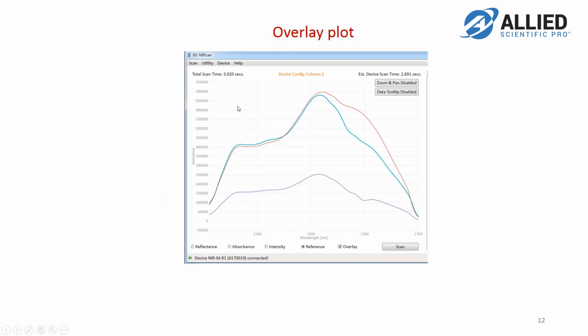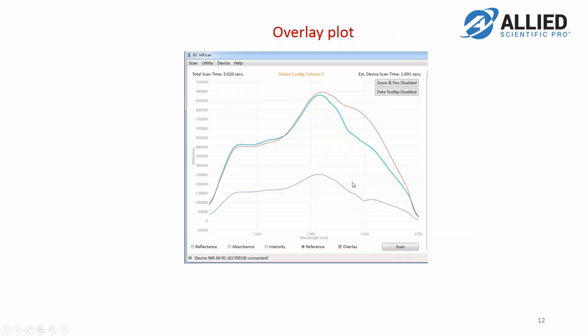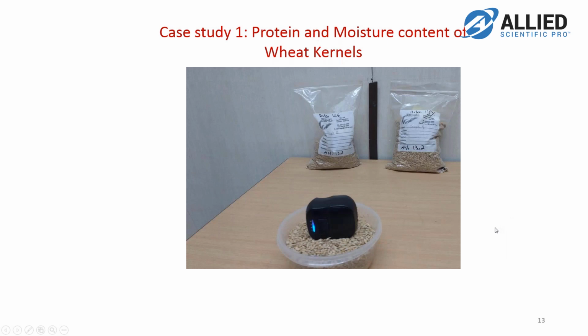Unfortunately, at the moment, this doesn't have a labeling mechanism, but we are working on that to see if we can introduce a labeling and printing mechanism on this one, but it's not available at the moment. You can always print all of these in Excel. There's a CSV file, and then you can label them and print from there.